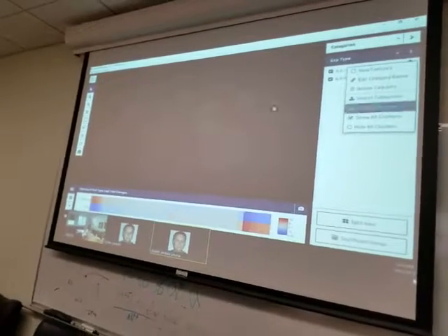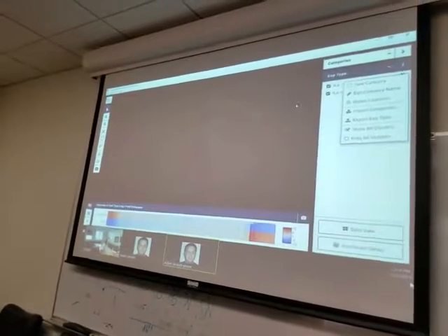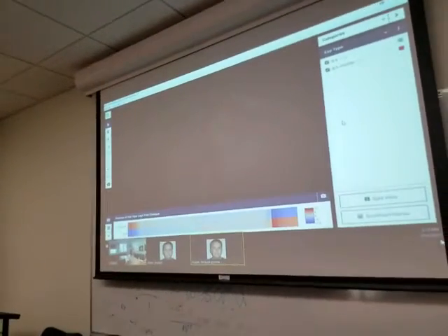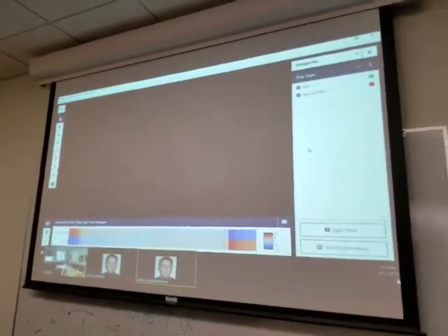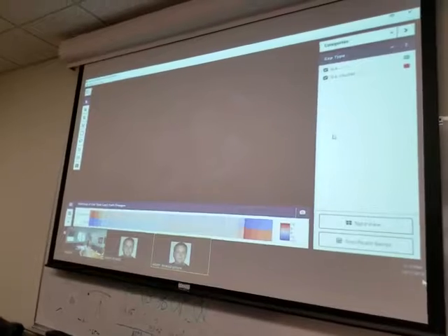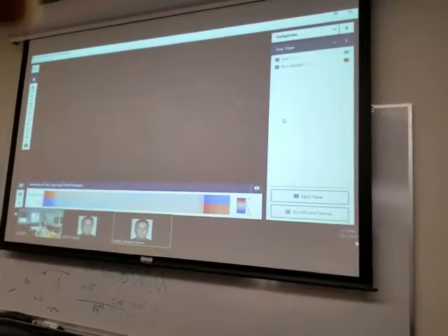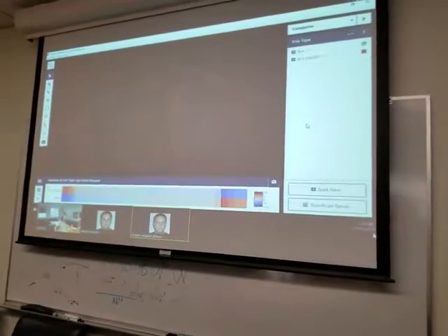So we can go export, and then we get the barcodes of all these red ones, and also all the green ones. If you export them, can you do something like a heat map or some way to export the genes, because there are genes underlying those red dots? Is there an easy way to export, like you did with the heat map down below? Is there a way to look at the top IL4 genes in that cluster versus the ones that are negative, group on the IL4 positive cluster, and then show it down below, those cells, right?